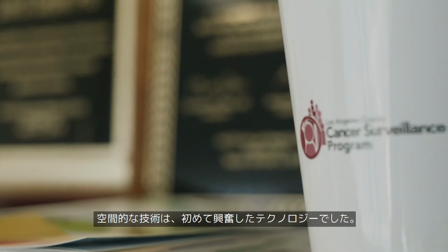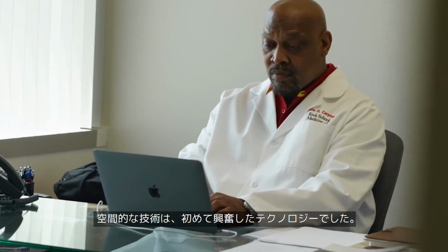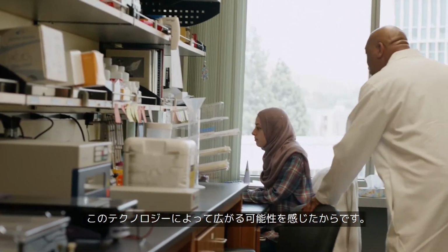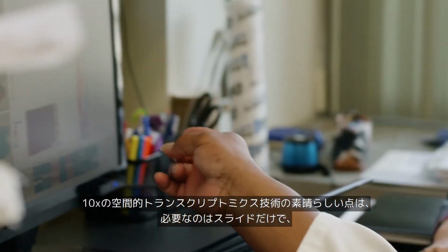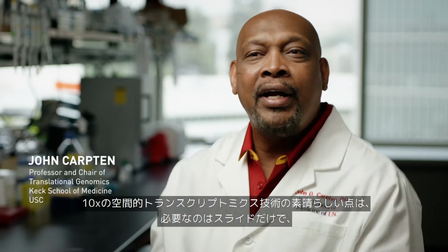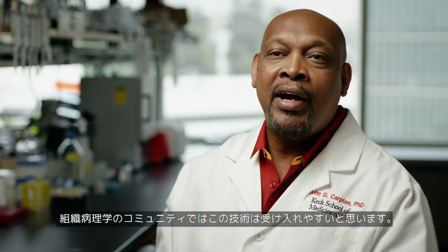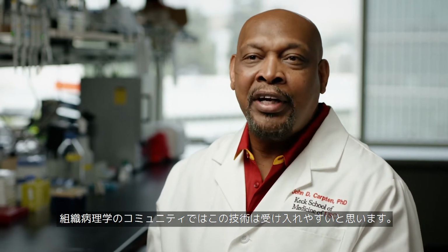Well, the spatial technology was probably the first time where I really got excited about a technology because of the possibilities that it opens up. The beauty of the platform is that all you need is the slide, right? There's no large piece of equipment that's required, right? And again, this is what will feed into the histopathological community because it's what they're used to working with, slides.